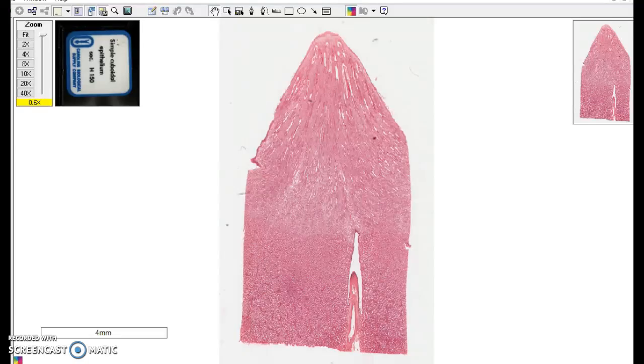Simple cuboidal epithelium. It has a very characteristic look. A great place to see it is in the kidney and this is a little section through a kidney.